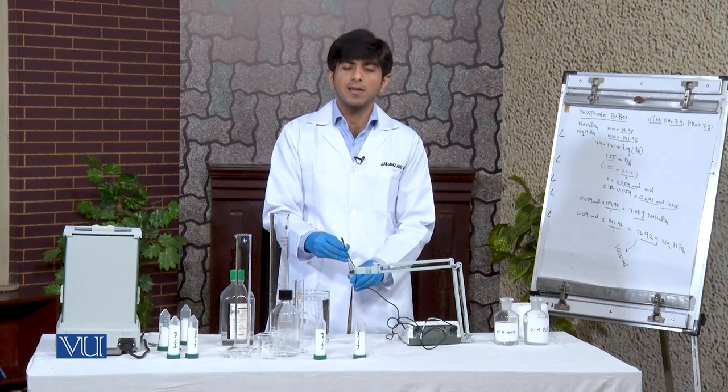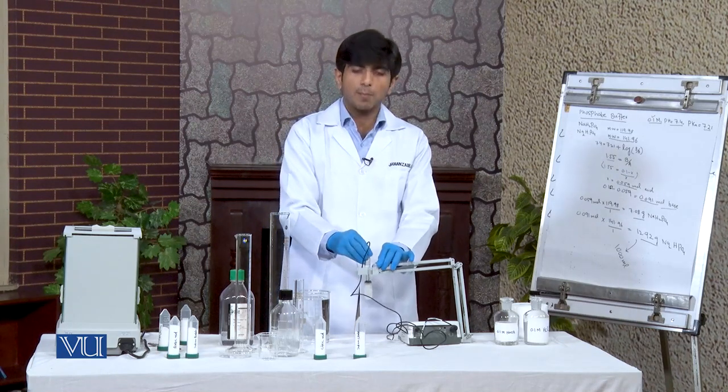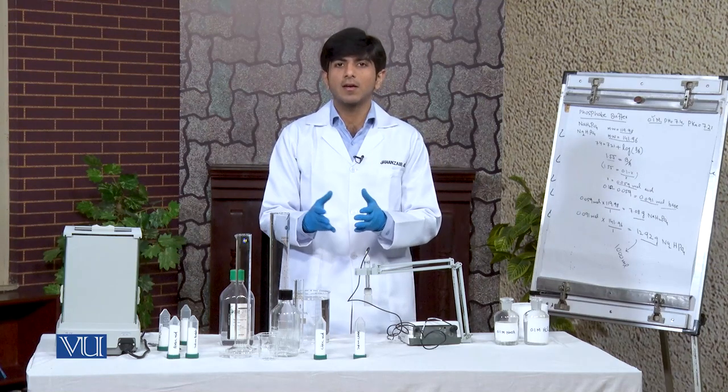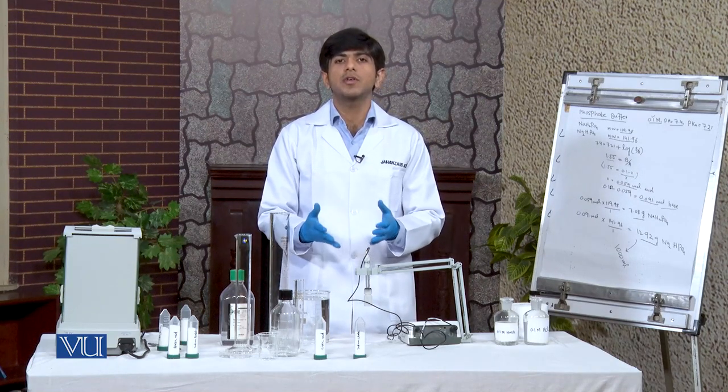After the pH maintenance, our buffer solution is ready and we can store this buffer in a reagent bottle for our future experiment.